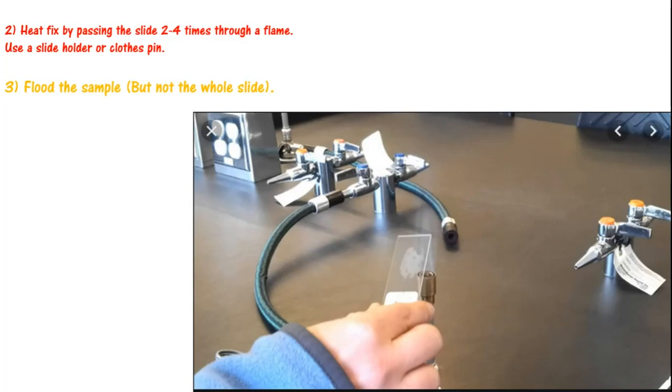Now step two is heat fixation. When I had a specimen on my slide, it is liquid and the specimen is still wet. So I will let it dry a little first. After that, I will put it on the Bunsen burner — passing the flame through the slide 2 to 4 times. I will use the slide holder clip so that I don't burn my hand. When heat fixation is done, you will then add the reagents.